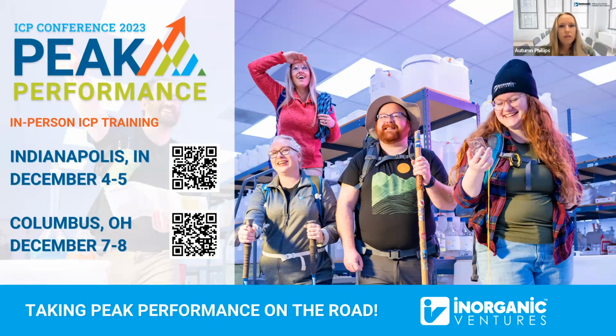Okay. How can I tell which element wavelength would be best to report from or most consistent? That's a debatable question. There's no direct answer to that. It also depends on the application. So the general advice I can provide, if you're new to the ICP, is first go to manufacturer recommendations or application people at your ICP manufacturer, or reach out to any of us or resources that you have.